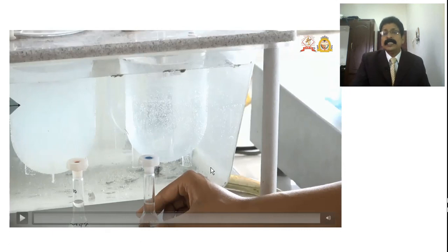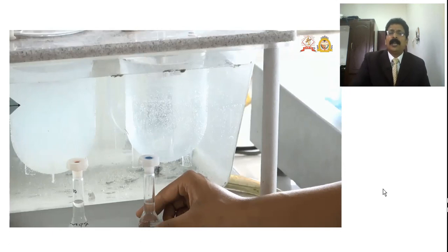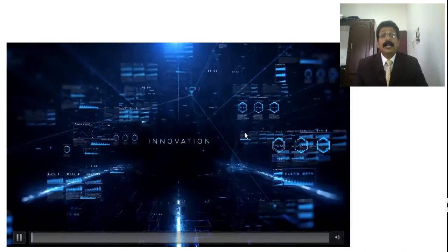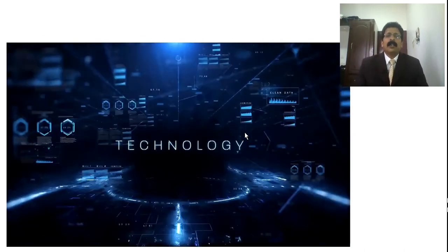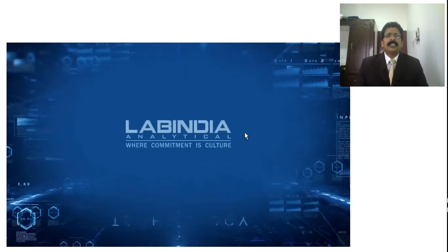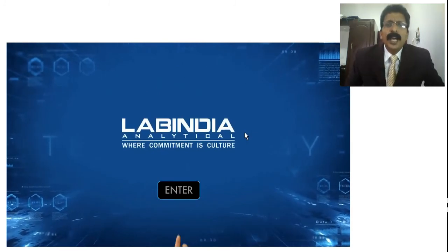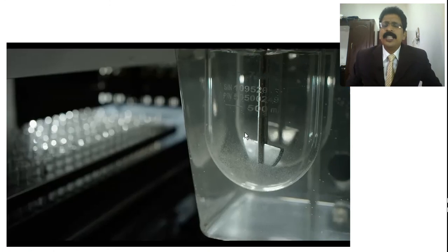So this is a simple procedure in the video, and I have taken another video showing new technology. It is very innovative and an interesting technology produced by Lab India, a very good instrument which is fully automatic.